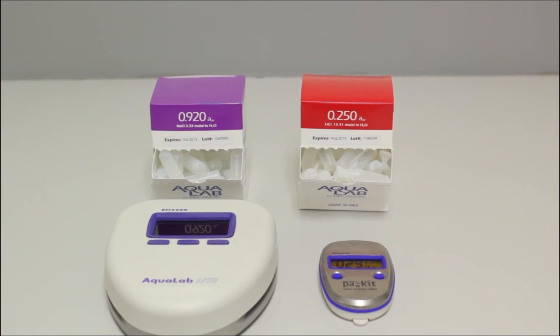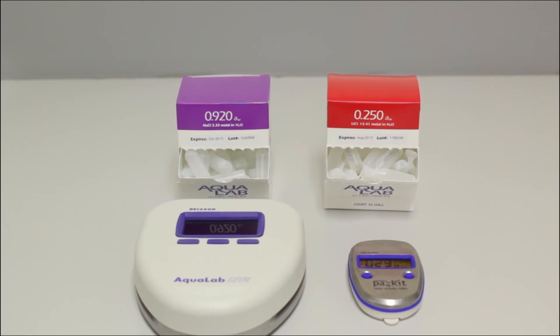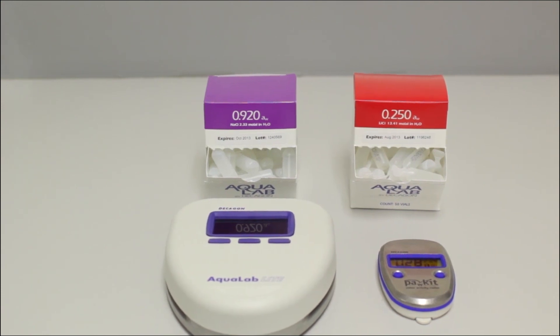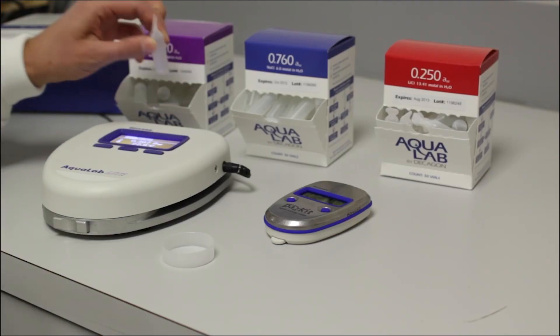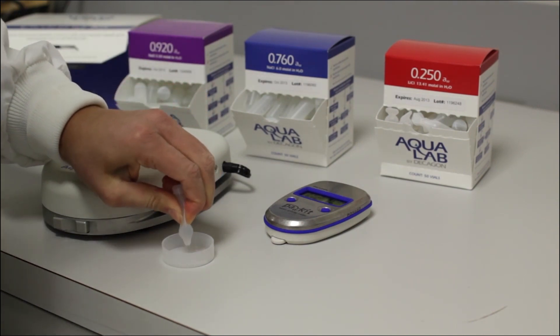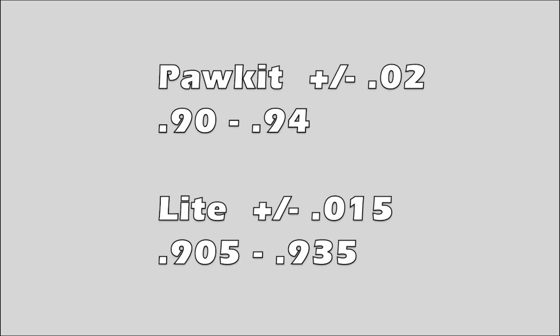If you are going to test a product with a low water activity, then you want to use the .250 standard for the second verification. If you are testing a product with a high water activity like jerky in the .800 range, you want to use the .920 standard for the second verification. Locate a vial of the second standard you are going to use, break open the vial, pour it into a sample cup, and if you are using the Pocket, place the instrument above the sample to test. In this case, we use the .920 standard. If it measures anywhere between .90 and .94, then we know that it measured within spec because the accuracy of the Pocket is to plus or minus .02.